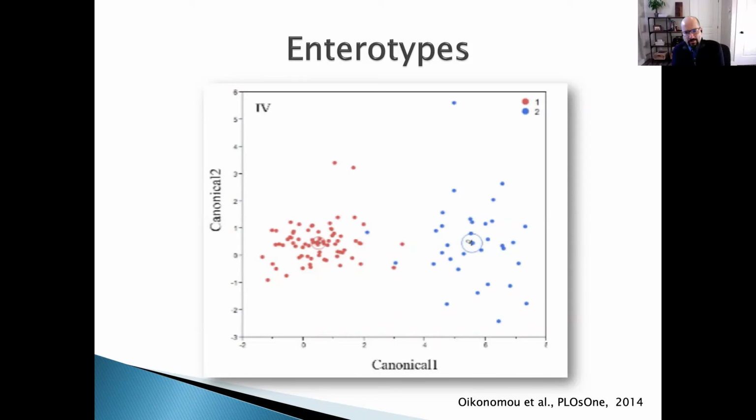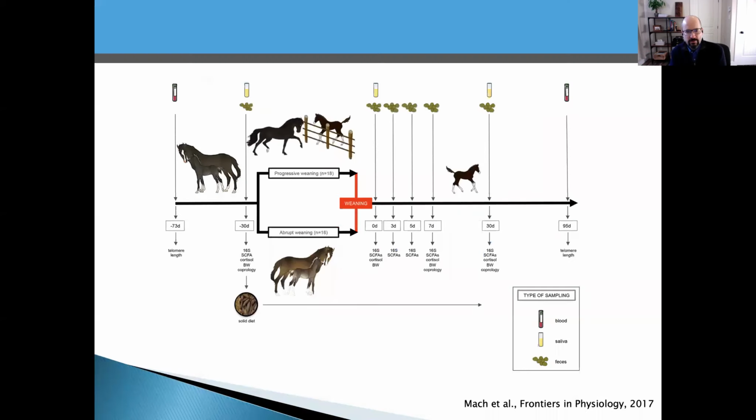So this is milk microbiota compared from two different farms. I'm just giving you an example of a data set where it's very clear that you have two different types of enterotypes. And sometimes we are dealing with milk, so you can call it milkerotypes. I don't know if you can, because the nomenclature comes from fecal or intestinal samples, but it became the name of the analysis, so we use it for different types of samples.